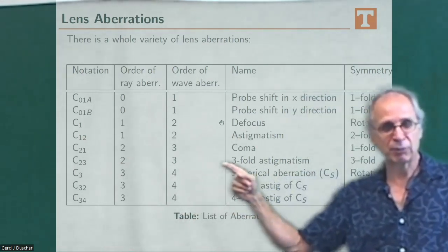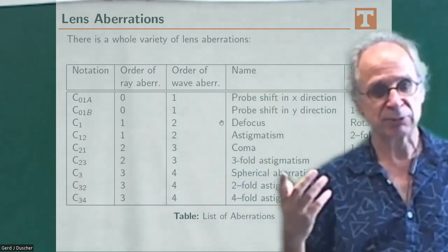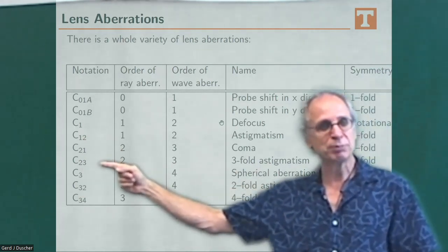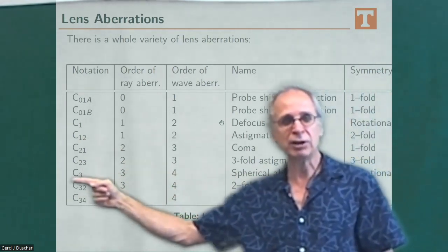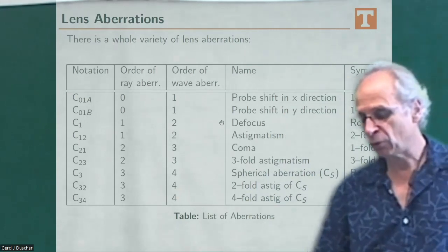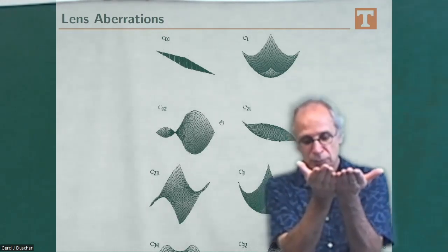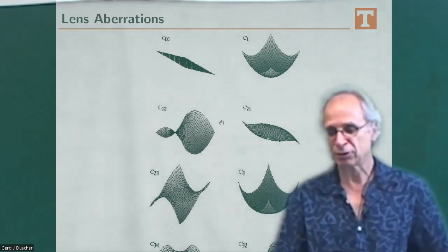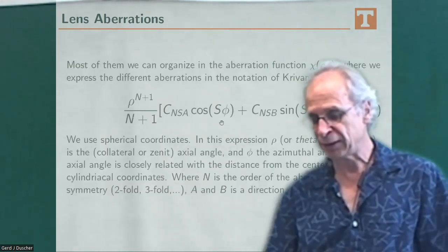And we have something called threefold astigmatism. In a Z contrast image that is very well aligned, which is an aberration corrector, your atoms will look a little bit triangular, so you can fix that. And then the key thing is this spherical aberration, C3,0. Then they go on and on. What they do is a perfectly nice flat plane wave will kind of warp in all kinds of different ways, and they are symbolized here by Andy Lupini.